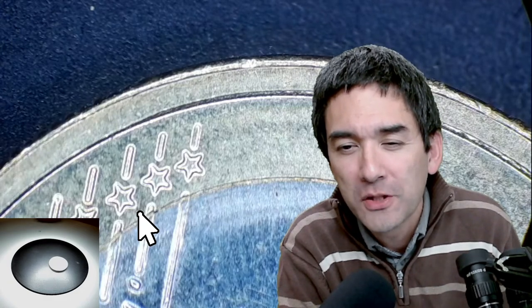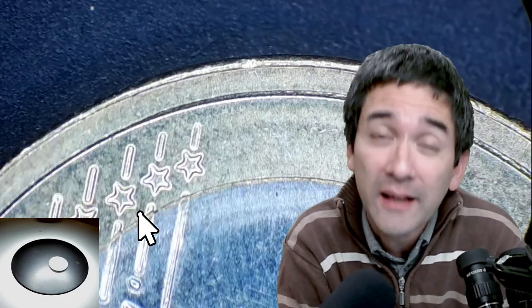Regarding preferred magnification: stereo microscope magnification goes up to around 40 times maximum useful range. You can go higher with so-called Barlow lenses — with this one I can go all the way up to 90x magnification — but I don't find it very useful beyond 40x. That's something I want to clarify.